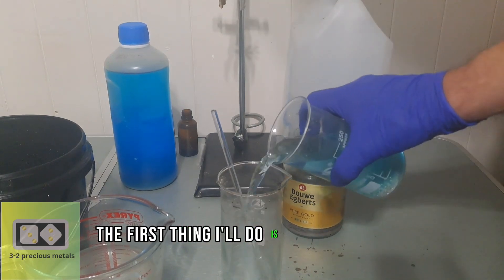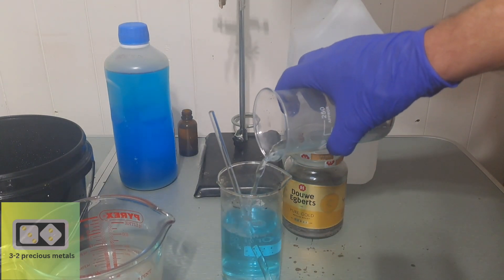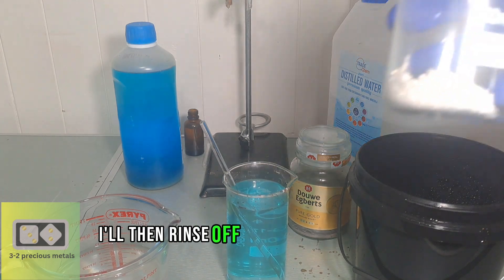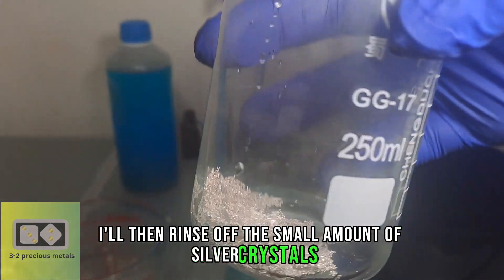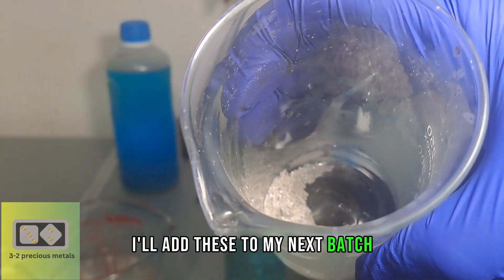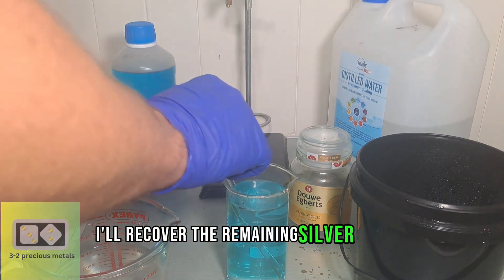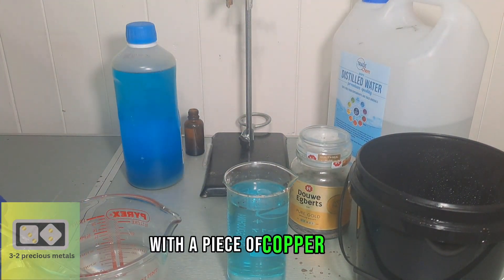The first thing I'll do is take this spent electrolyte and pour it into another beaker. I'll then rinse off the small amount of silver crystals and add these to my next batch. I'll recover the remaining silver in this solution with a piece of copper coil.